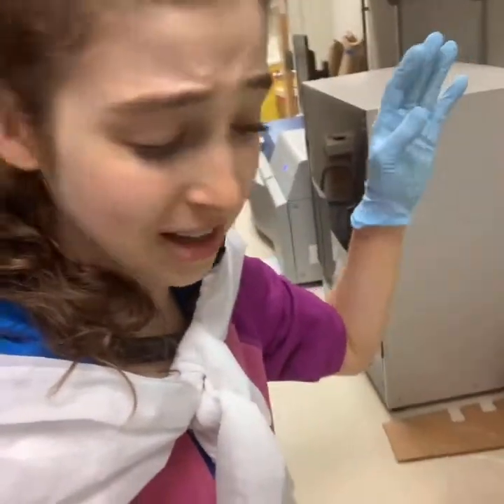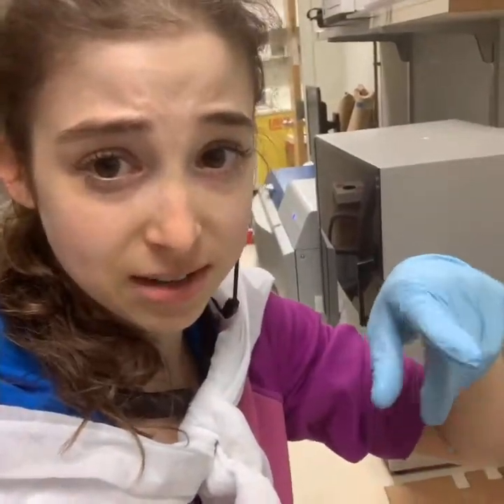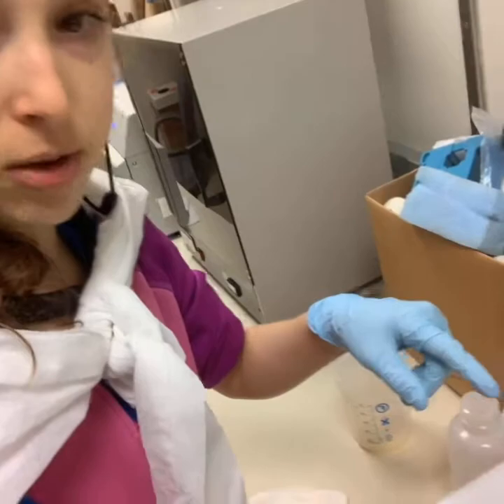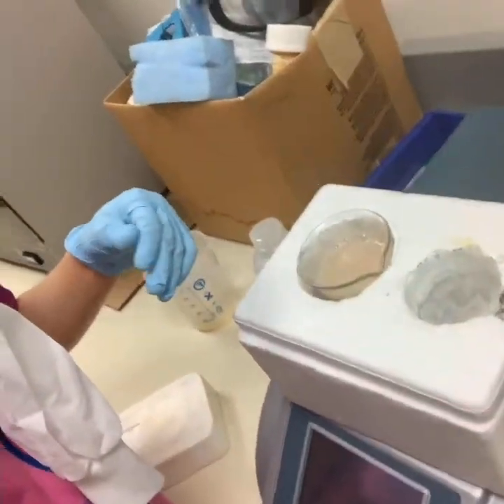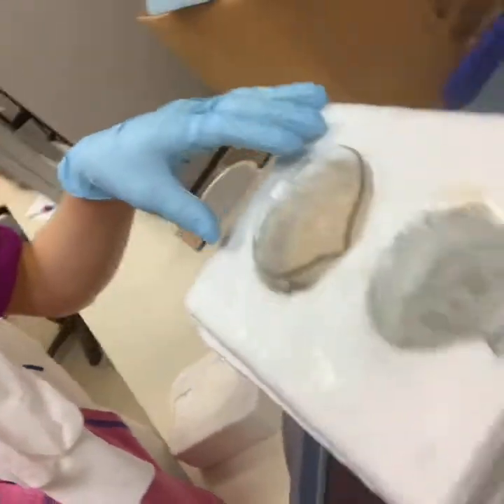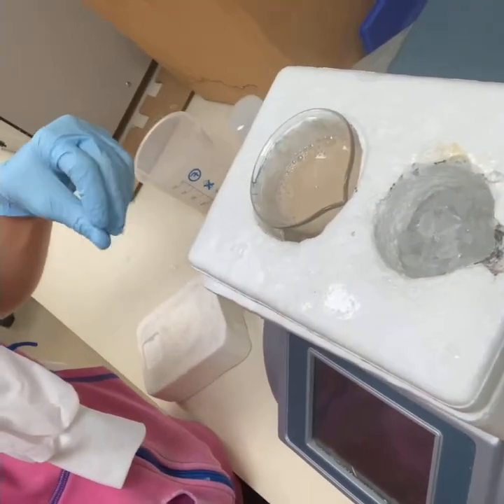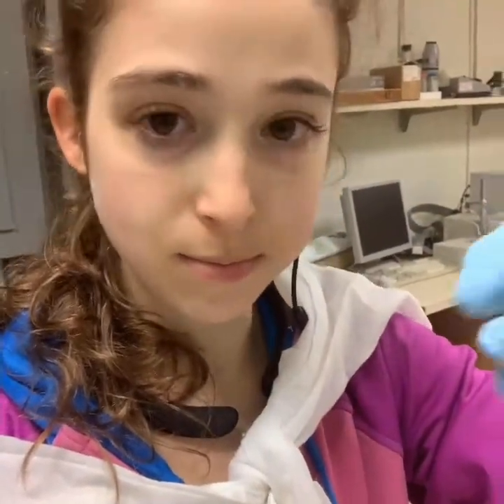I'll talk more about it, but first I want to show you it because it's kind of interesting. The process is going to generate heat, so I have it in this ice water bath made out of styrofoam — a styrofoam box filled with an ice water bath. There's a little cutout so that your beaker doesn't fall down as the ice melts. Basically, you don't want your protein to get hot, which is why we use ice.